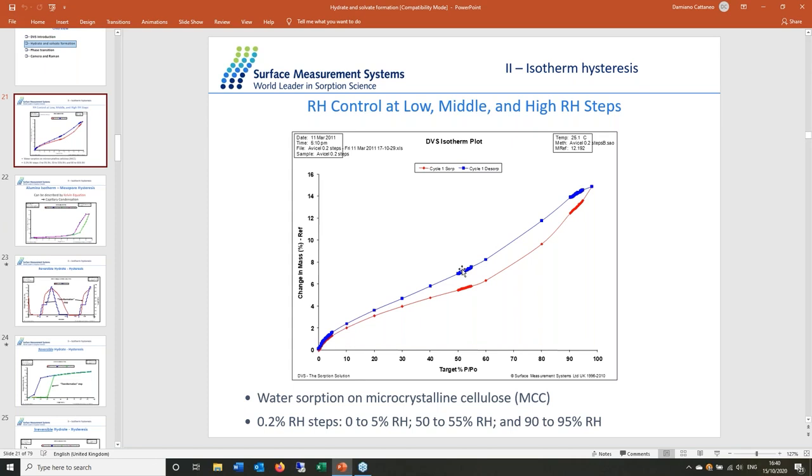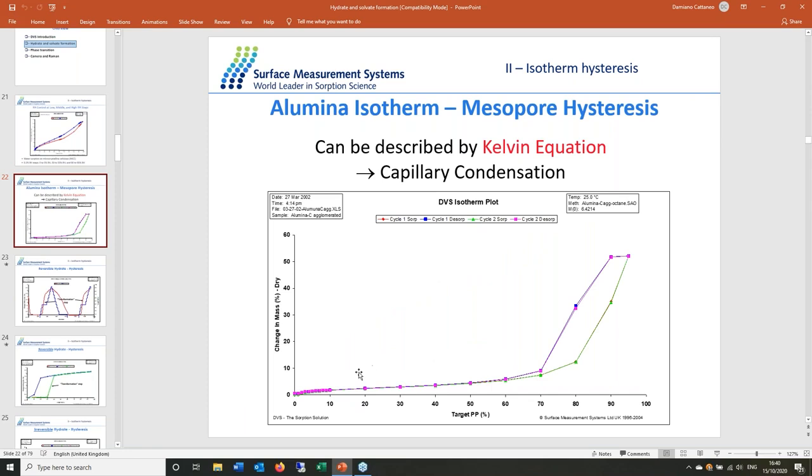Now, that's not to say that all the behavior is the same. This is specifically related to bulk absorption, so when the molecules are going through the bulk. If you look at the condition, for example, on surface sorption, right here, this data, the first section, is pure surface sorption. And in this case, there is no bulk sorption, so there is no interaction of molecules through the bulk.